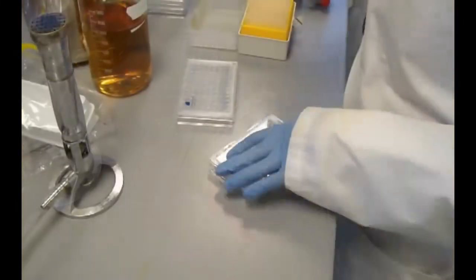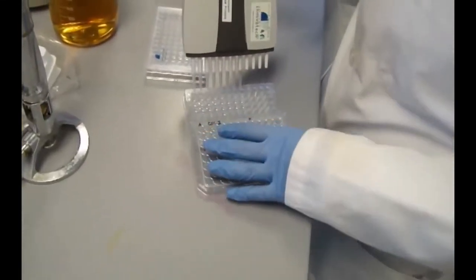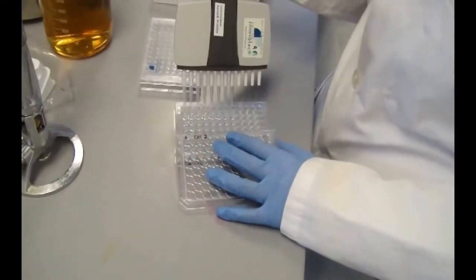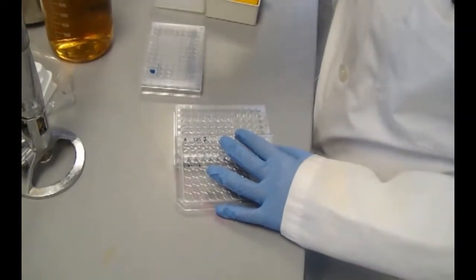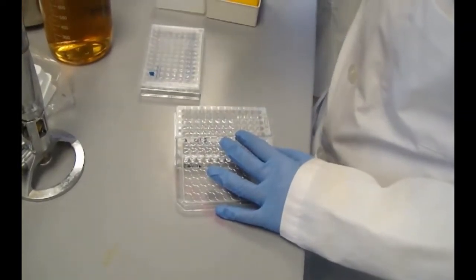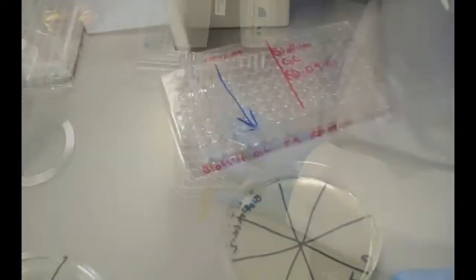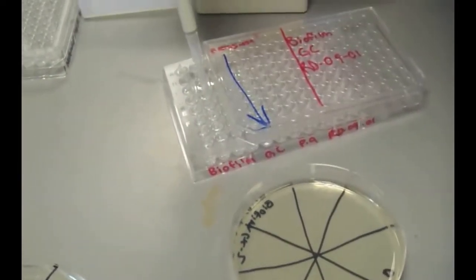The viable cell count is determined by removing 100 microliters from each well of the recovery plate and serially diluting and spot plating. Colonies are counted after an appropriate incubation time and may be used to determine log reduction.